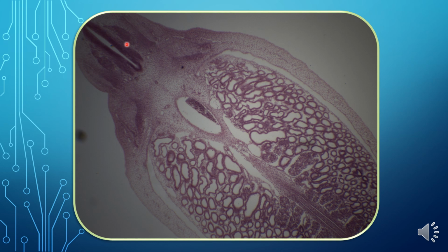Also again, neural tube, ventral to it the notochord, ventral to it the dorsal aorta. Here you can see clearly the renal system.